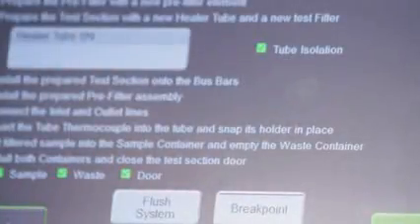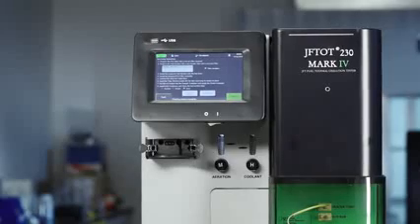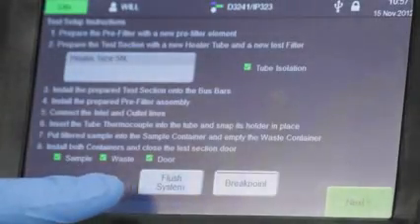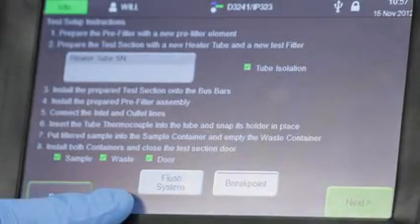For the test setup instruction screen, this lists all the steps to assemble and install the test components to the JFTOT. You'll also see button commands on this page that allow you to manually flush the system or to start the automated breakpoint program.